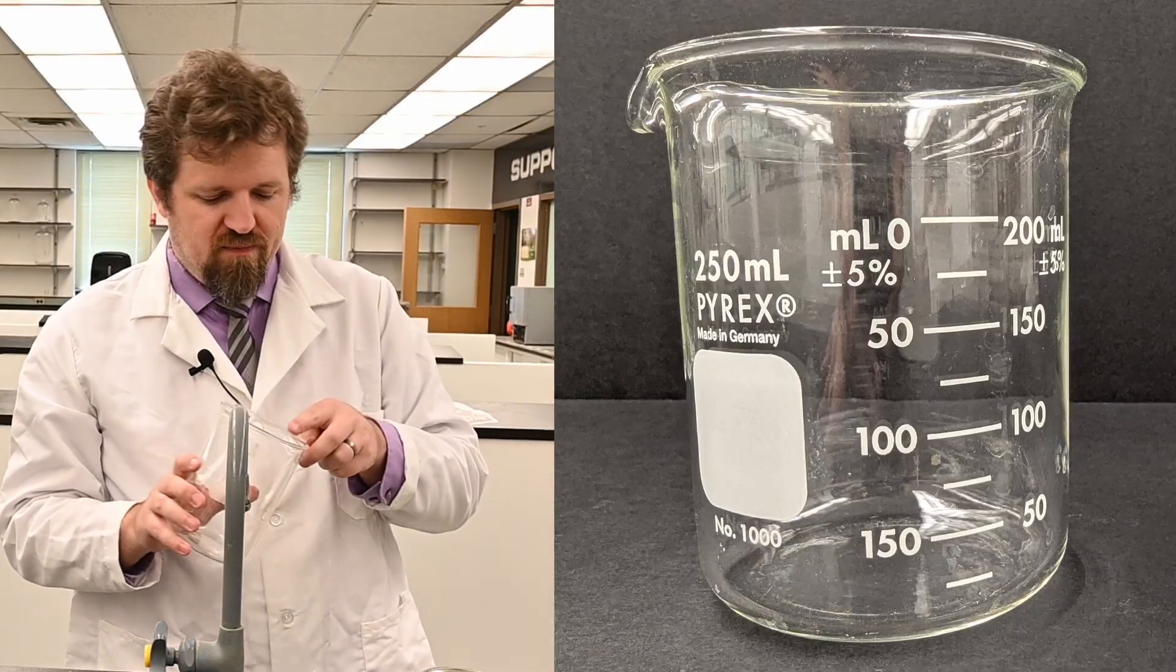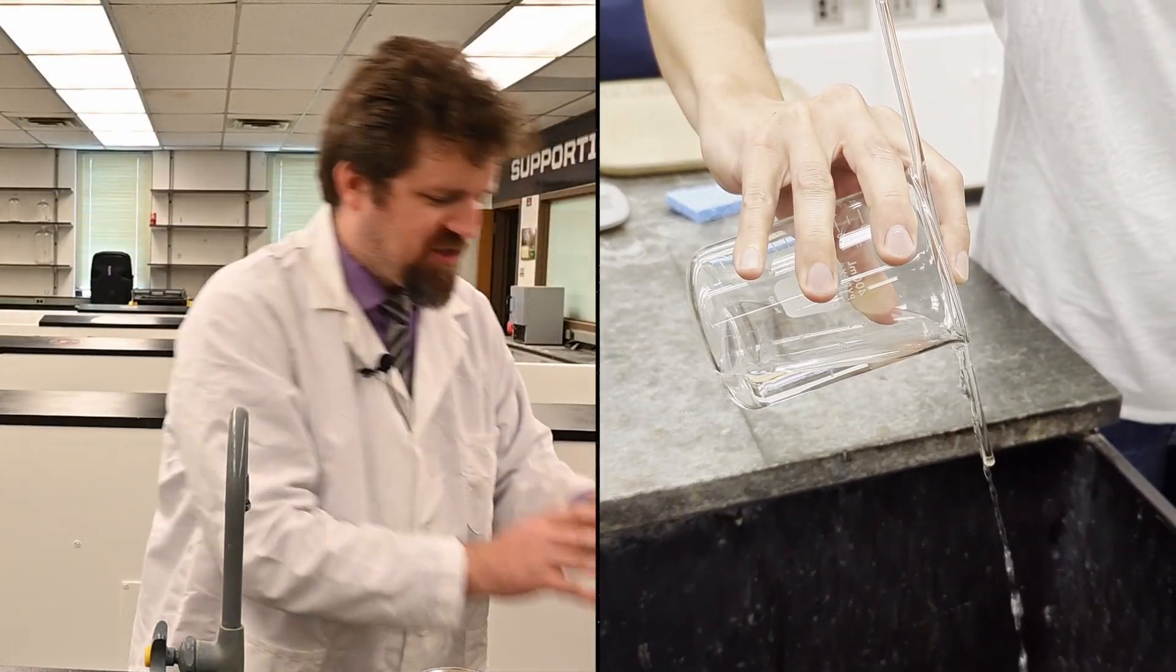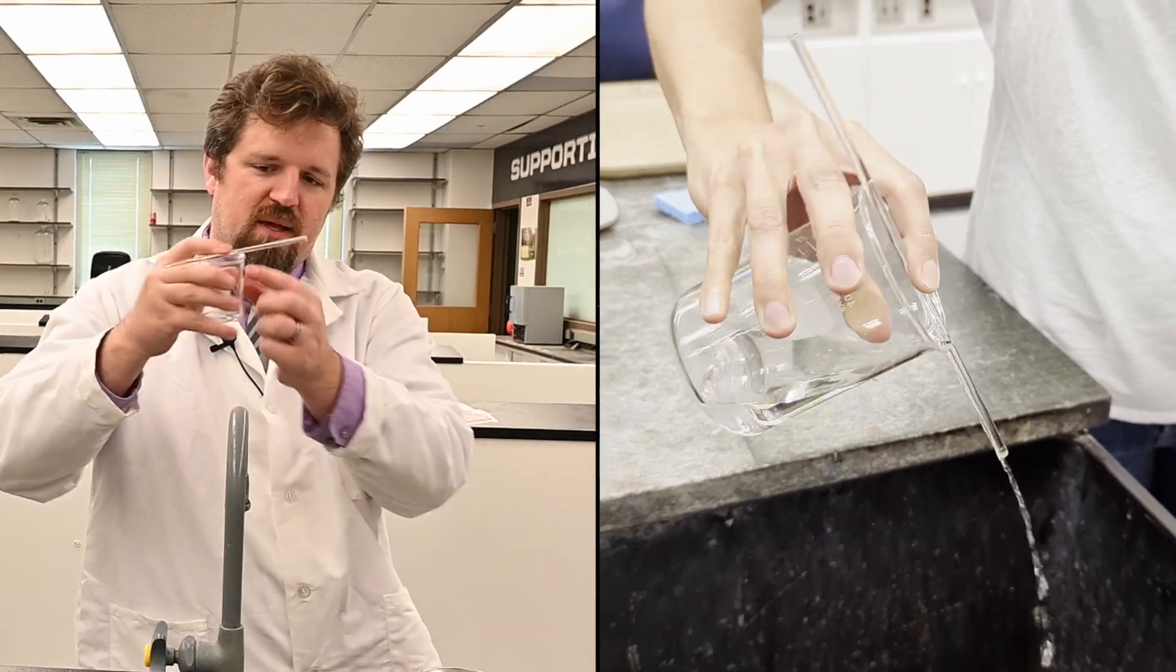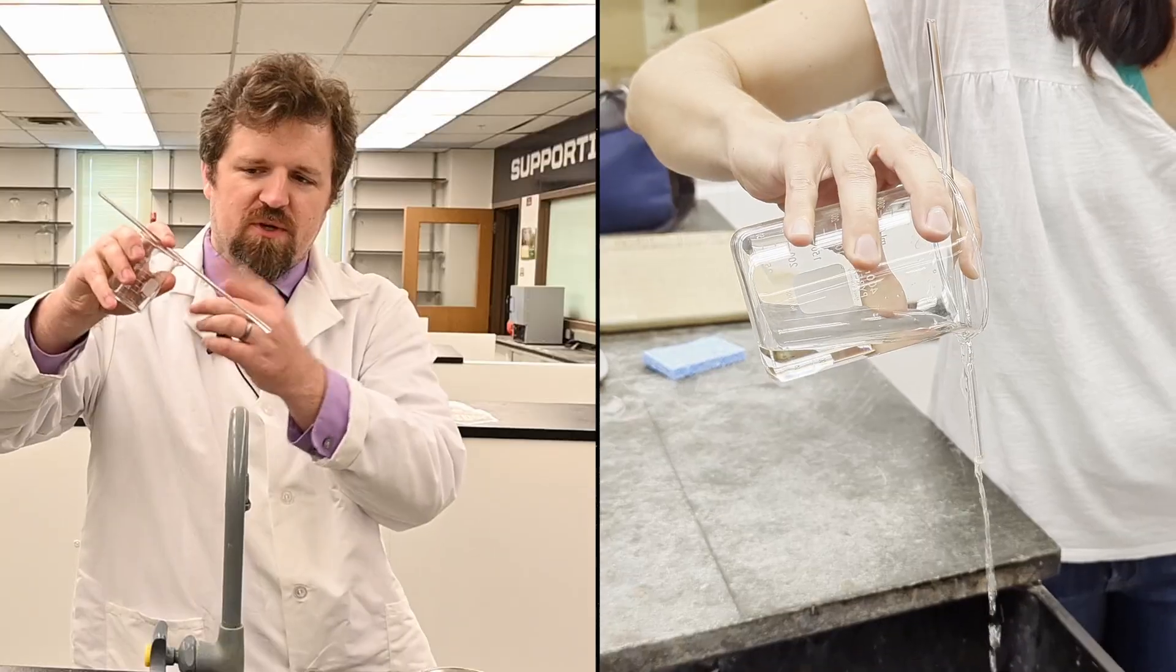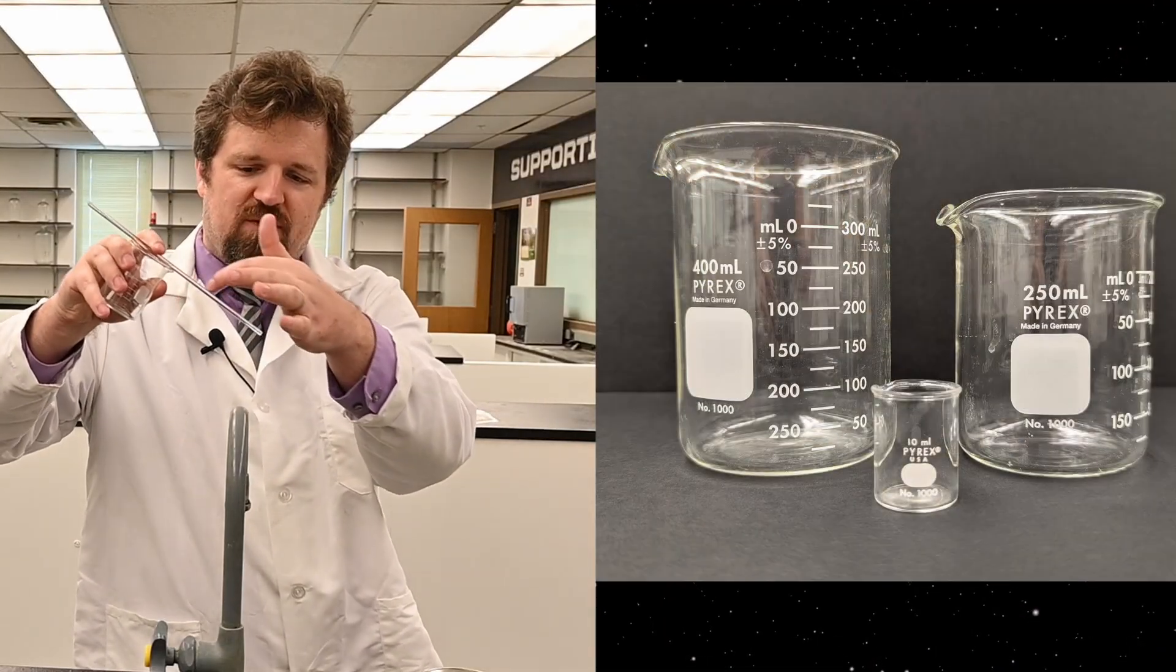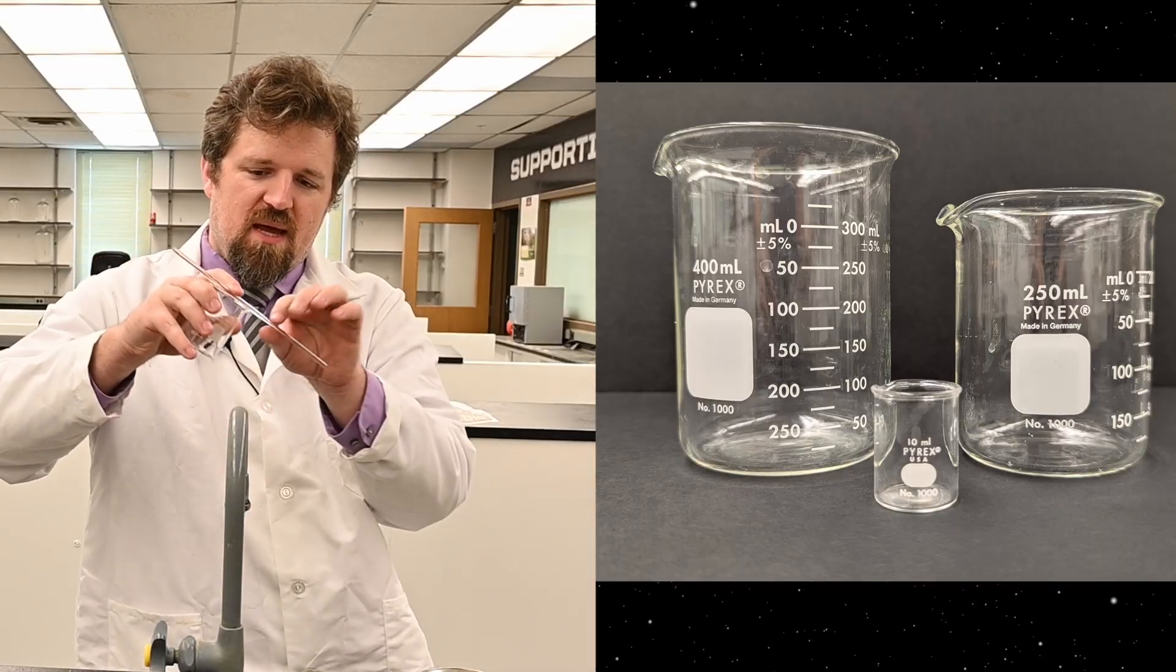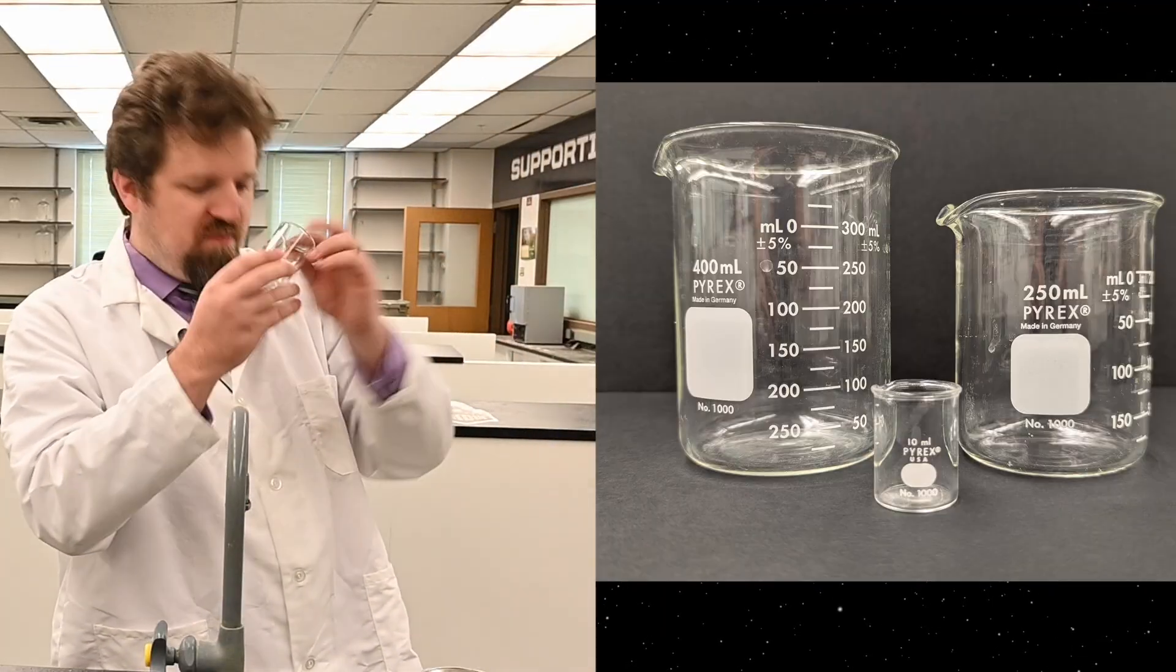One little quick side note I want to show you is that sometimes you can take, this is called a stir rod. If you take a stir rod and you place it over the beaker, it'll actually nestle down into that little divot there. And this is called decanting. You can actually have a liquid travel down the end of the glass rod and into whatever you're trying to pour it into.